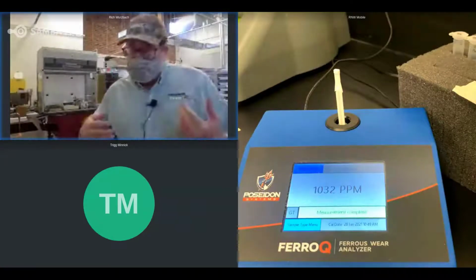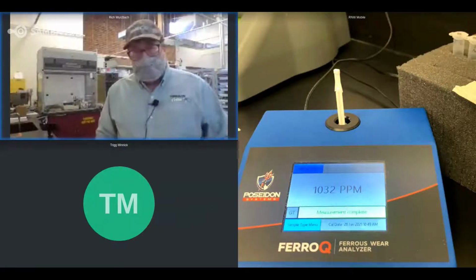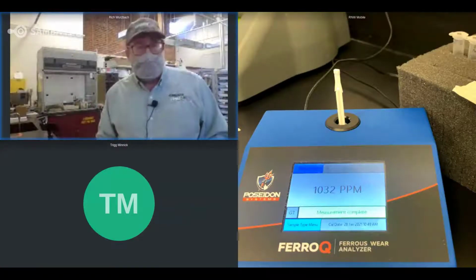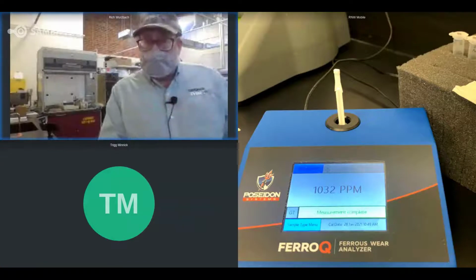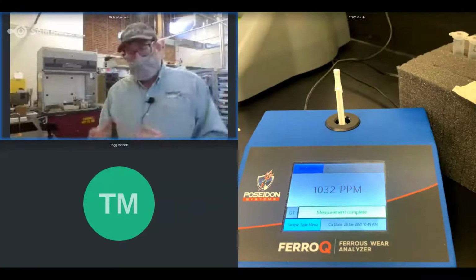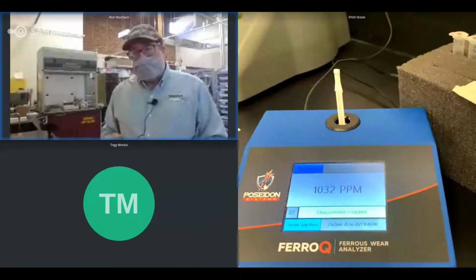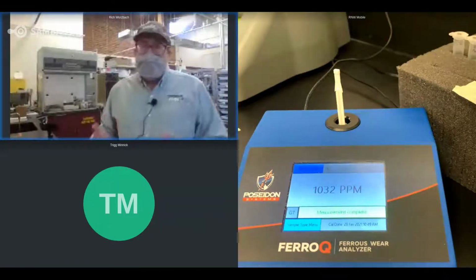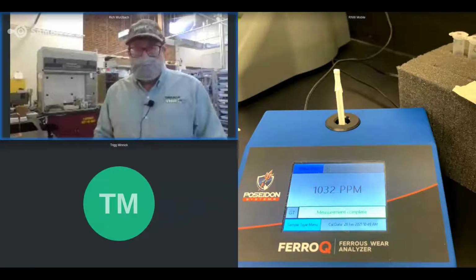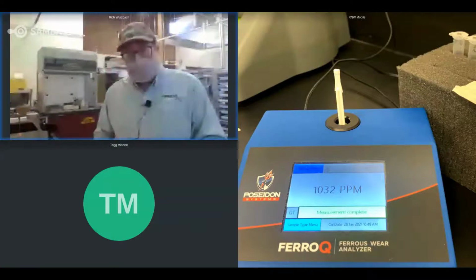So if we are used to looking at it for oil analysis, or if we're seeing both in a grease analysis report, both elemental iron and ferrous ppm values, they're different in this way. Again, the elemental iron is going to be dissolved, perhaps oxidized, but small particles. On the other hand, we're looking at a magnetic technique here, or ferromagnetic technique. So it's going to be looking at particles independent of their size. However, when the iron gets oxidized, so rust, corrosive wear, and so on, it reduces its magnetic susceptibility, or really the influence it has on that magnetic field.